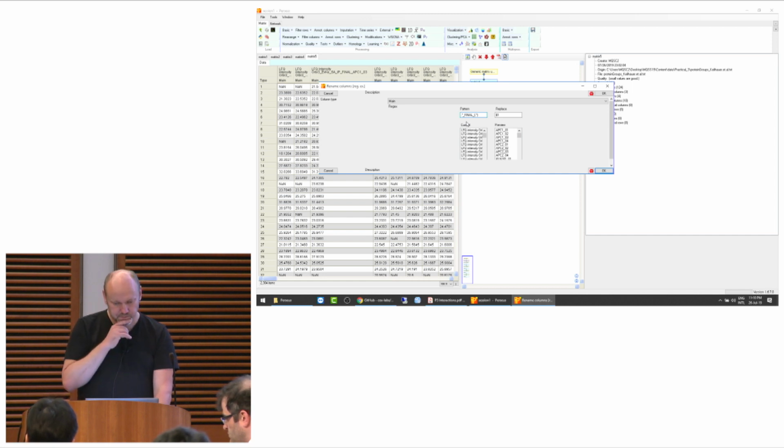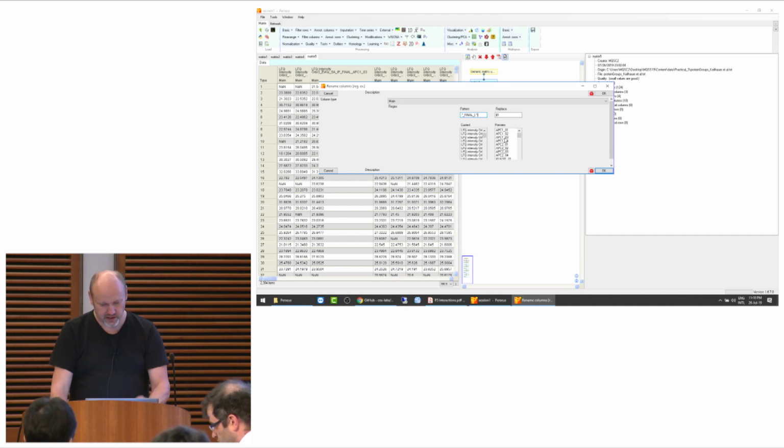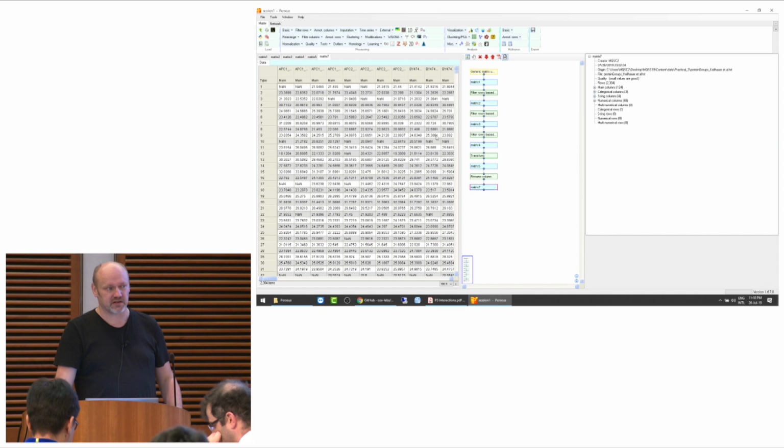That means match everything, and then final, and in the parentheses comes what you want to keep. You see down here the effect of applying this regular expression to the column names, and it's exactly what you want. You get rid of the repetitive beginning. So let's do that.